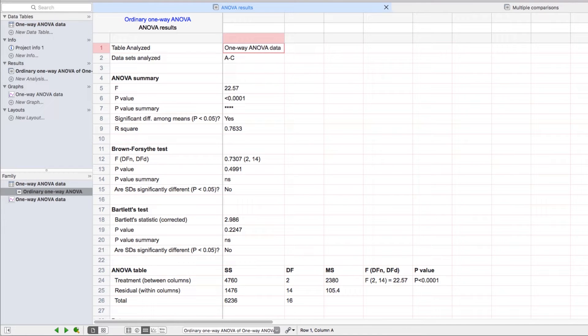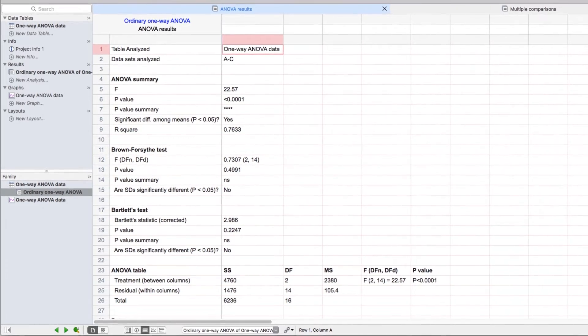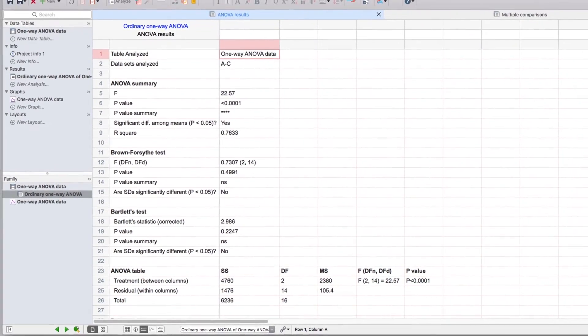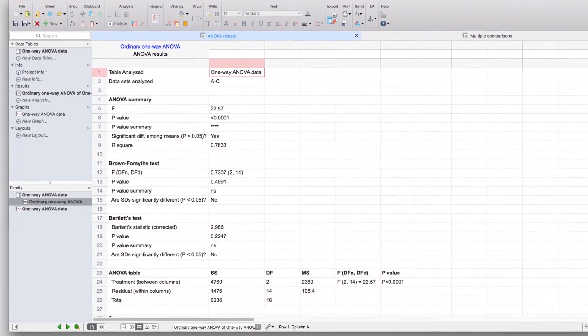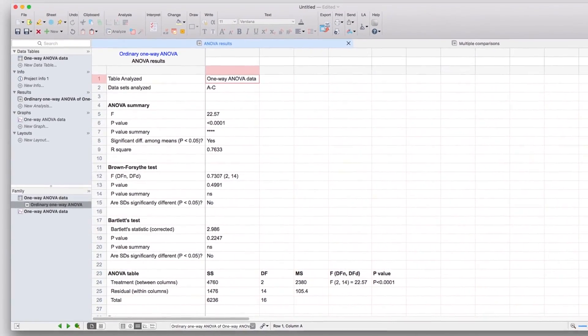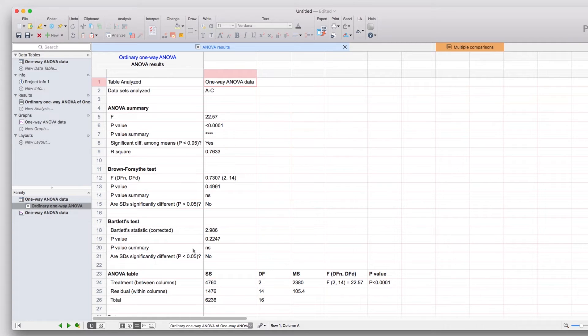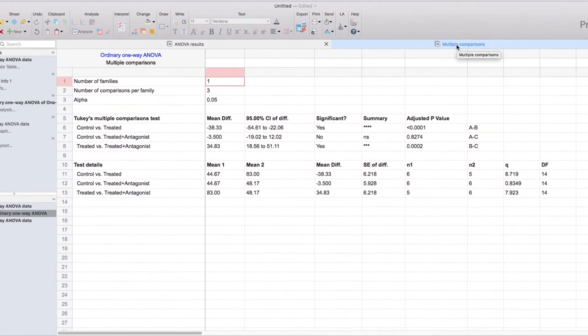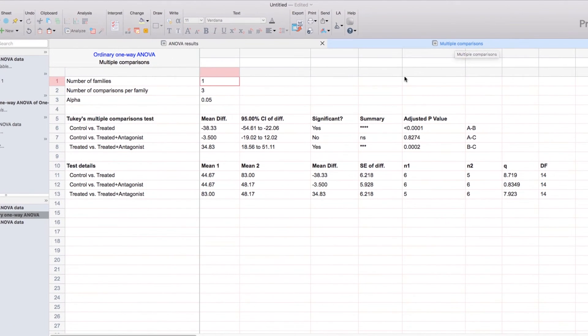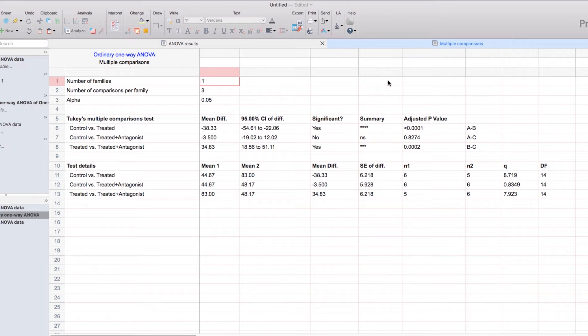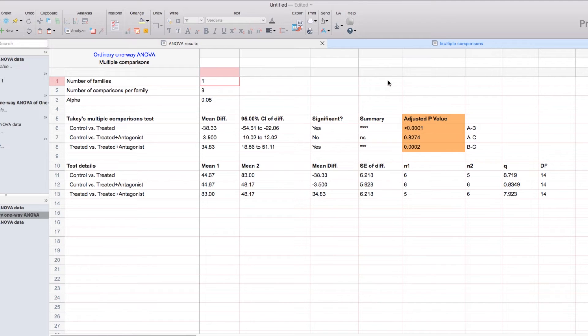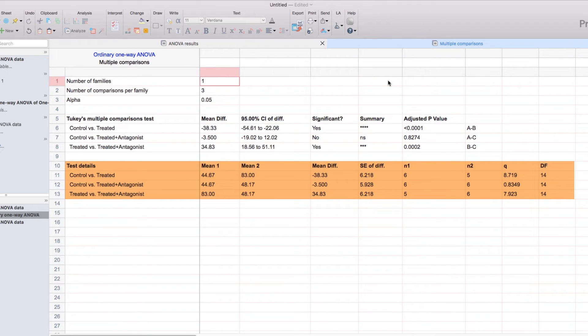However, this sheet doesn't provide the information on the multiple comparisons that we identified in the analysis parameters dialog. Those results are found on a separate sheet. Each analysis that generates more than one sheet of results will display those results as a separate tab. Here you can see the tab for multiple comparisons can be found next to the sheet for ANOVA results. When we click on the multiple comparisons tab, we'll be shown the results of the comparisons between specific pairs of groups that we identified in the parameters dialog, including the difference between their averages, the 95% confidence interval of that difference, the calculated p-value for the difference, as well as the summary of significance. In addition, we'll have the test details that indicate the average of each group, as well as the sample size for each specific group.